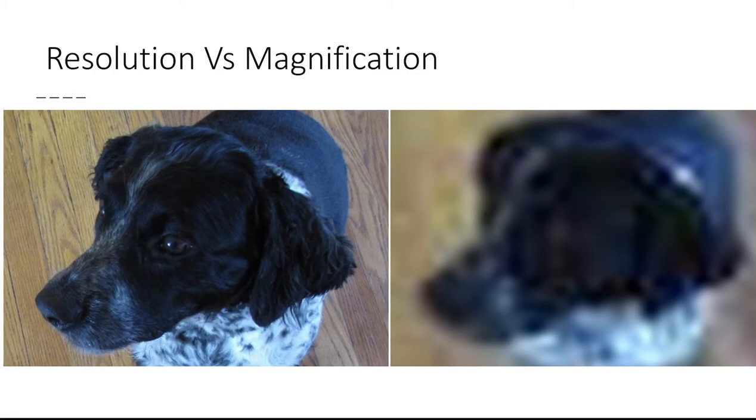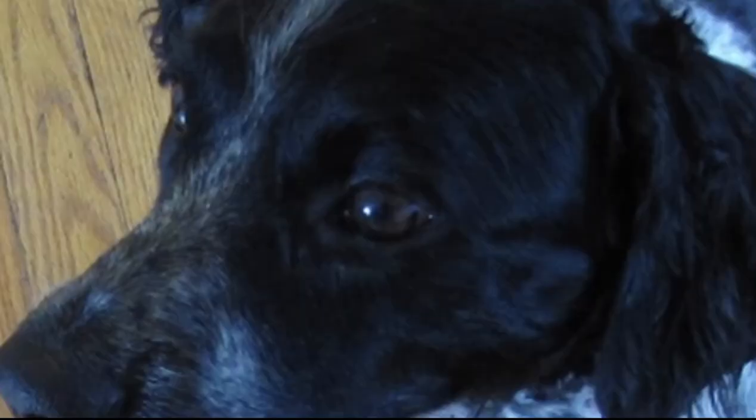However, it doesn't make the grain of the wood in the background any more clear, or the hair or fur on the dog's head. In fact, as we magnify further, we can actually tell that the image is of a lower quality. It just simply looks a lot blurrier, it looks a lot less sharp, and you can notice the difference in resolution.